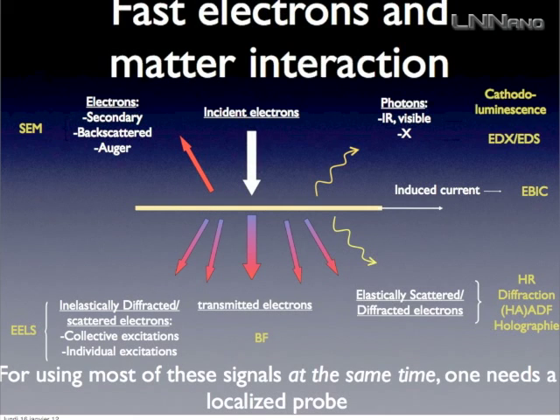Okay, so let's begin at the beginning. I'm sure you had other lectures that explained that what you are doing in TEM, in electron microscopy or microscopy in general, is of course an image, but it does not mean that this is by any means an image of the reality, whatever the reality could be. It's just a result of the interaction of an electron with some material.